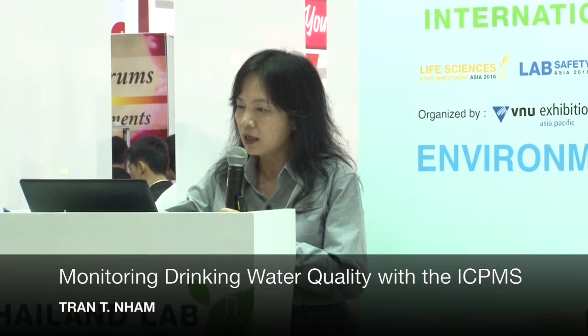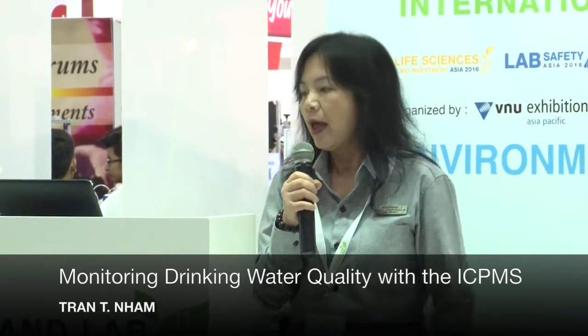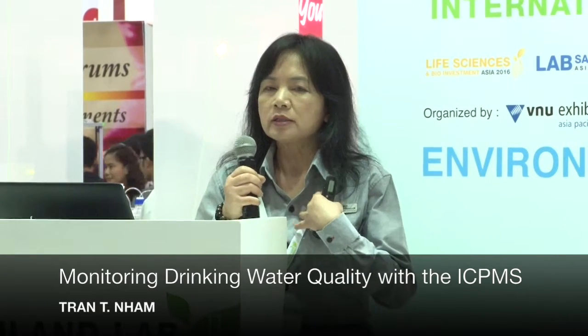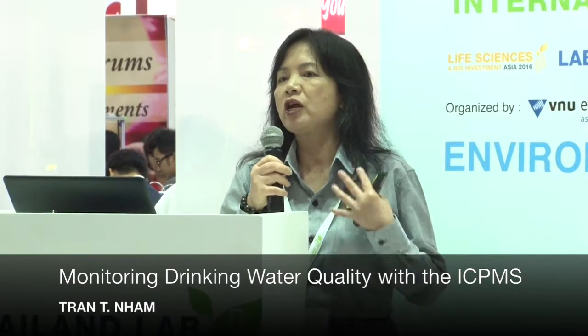Okay. I'm talking about how to monitor drinking water with the ICP-MS, right? As we know, three quarters of the Earth's surface is covered by water, and we need water every day for our life. Also, because of the cells in our body, we need water for the body to function. So that means we need to drink water every day. So quality, safe drinking water is very important to maintain our healthy life.